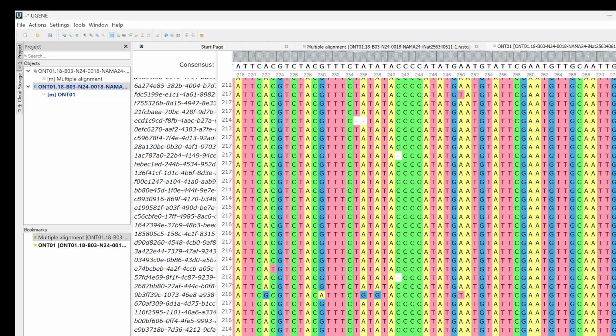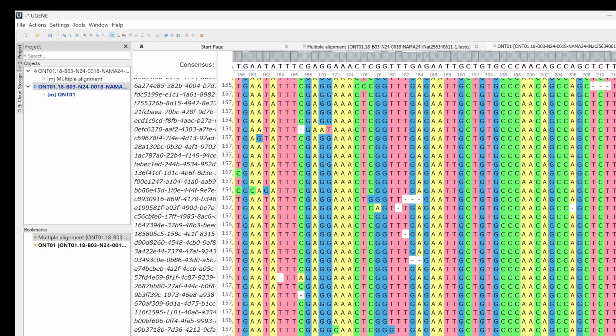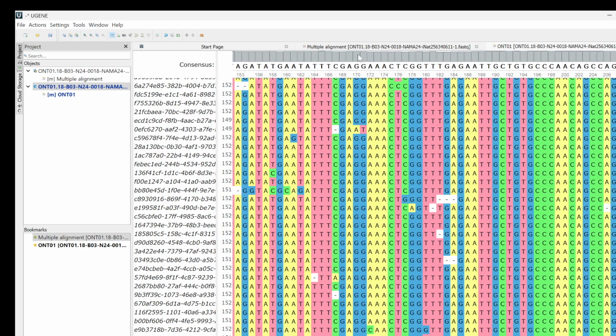And what I'm going to do is I'm looking down at this. This is a really bird's eye view of the sequence, and where it's gray, it means everything agrees, and where it's white, it means there's a disagreement. And so I can look where all the disagreements are, and that's referenced here in this little top area.